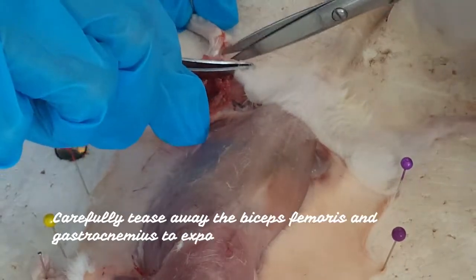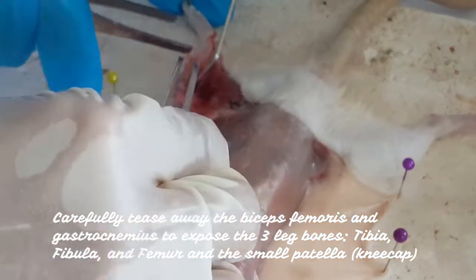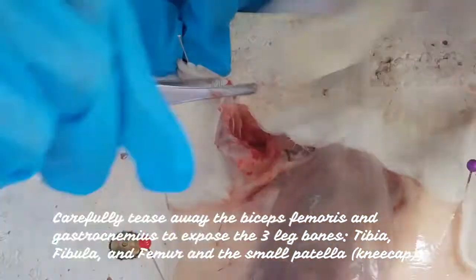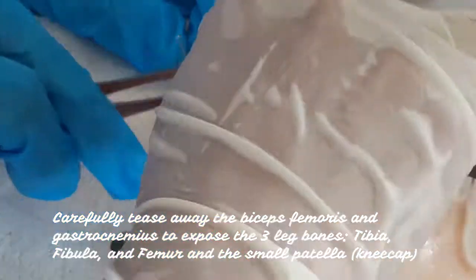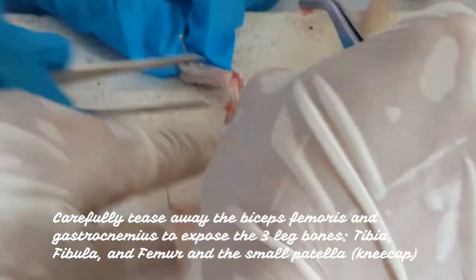Carefully tease away the biceps femoris and gastrocnemius to expose the three leg bones, which are the tibia, fibula, and femur, and the small patella, or kneecap.